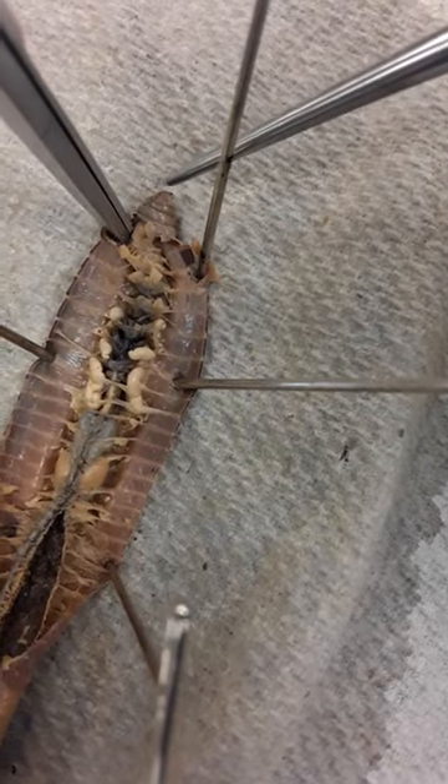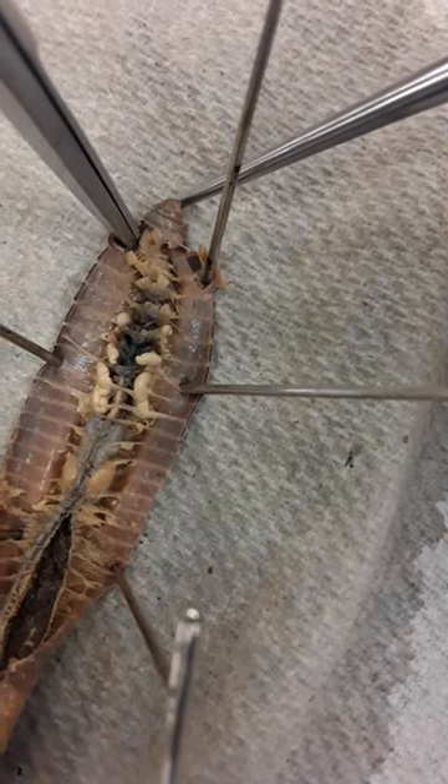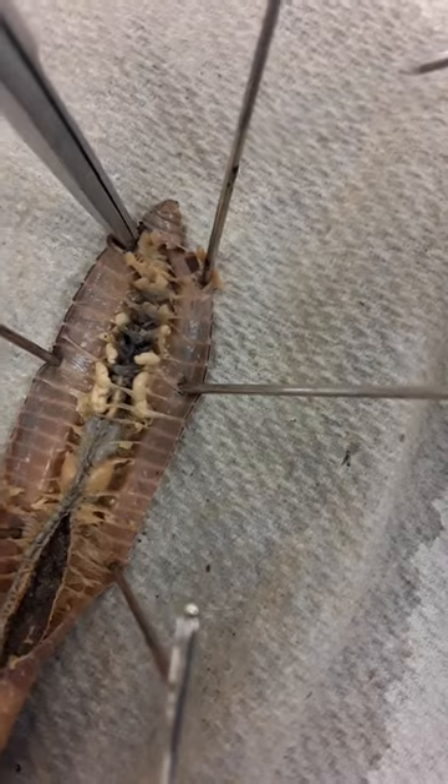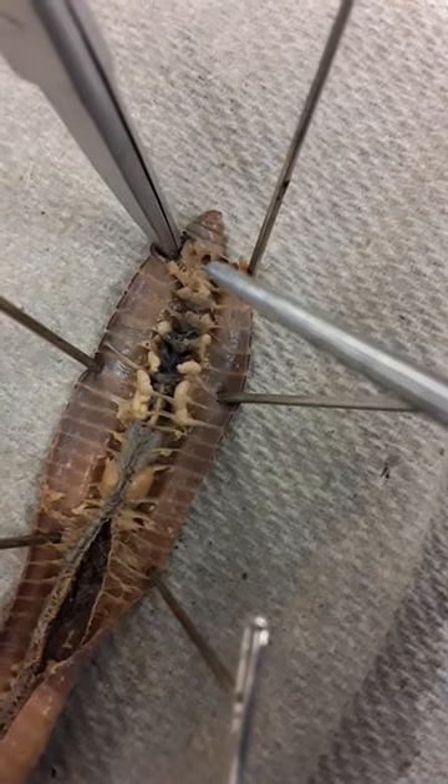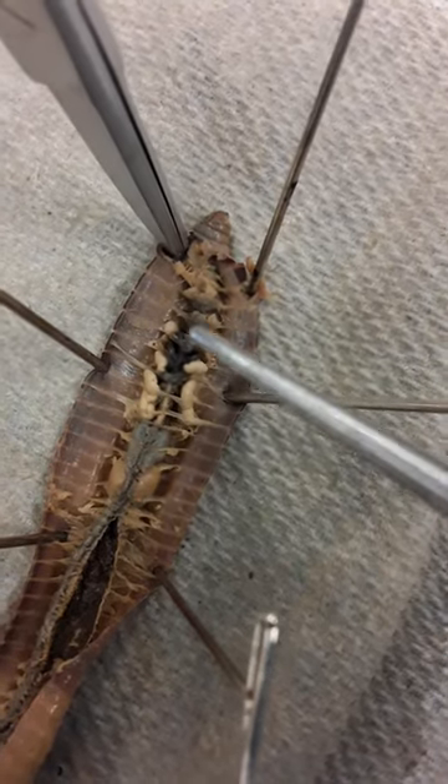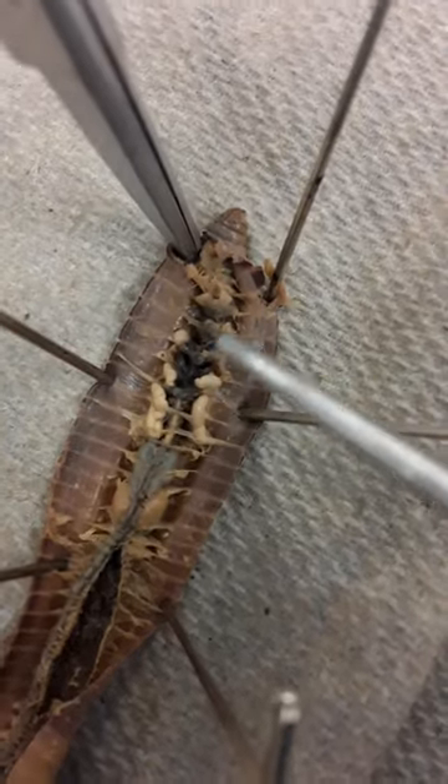This is my earthworm dissection. Right up here, right underneath, would be the mouth of the earthworm at the very front. Right behind that, right in here, is the pharynx area. The esophagus would be right here — you really can't see it in this particular specimen.